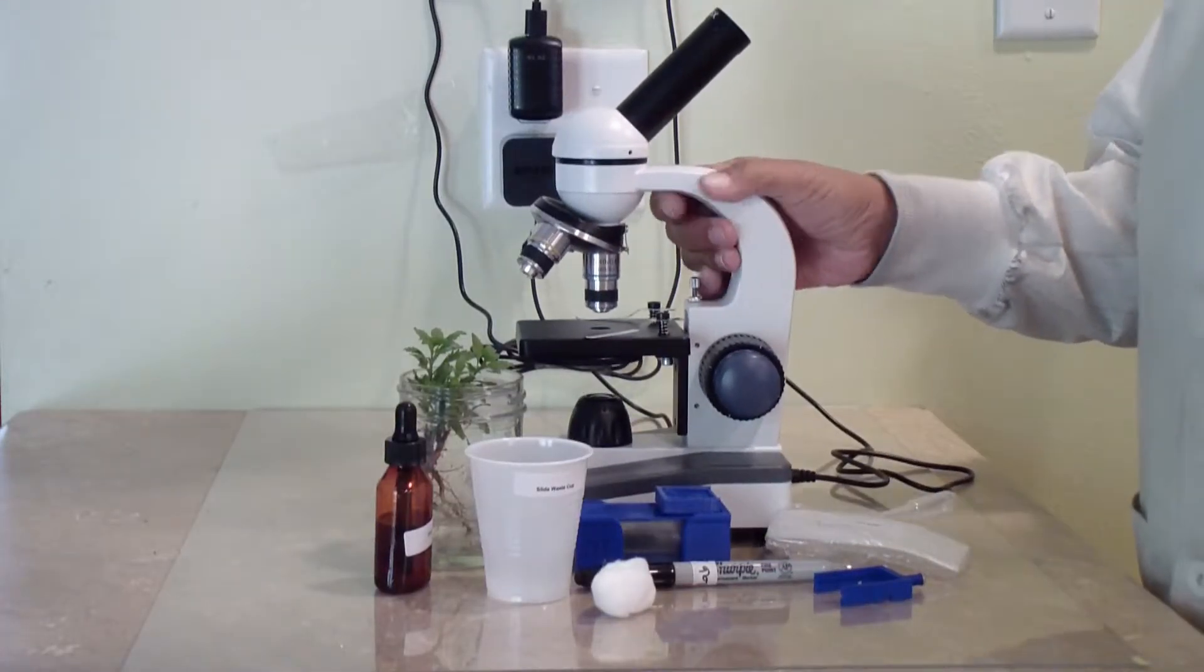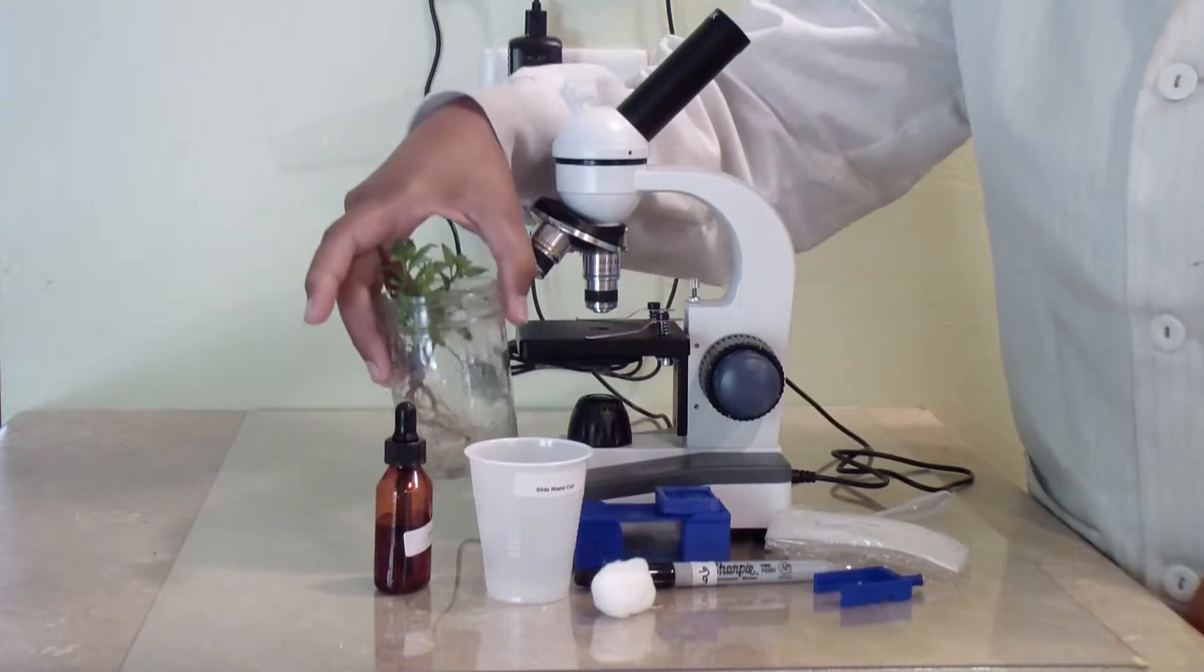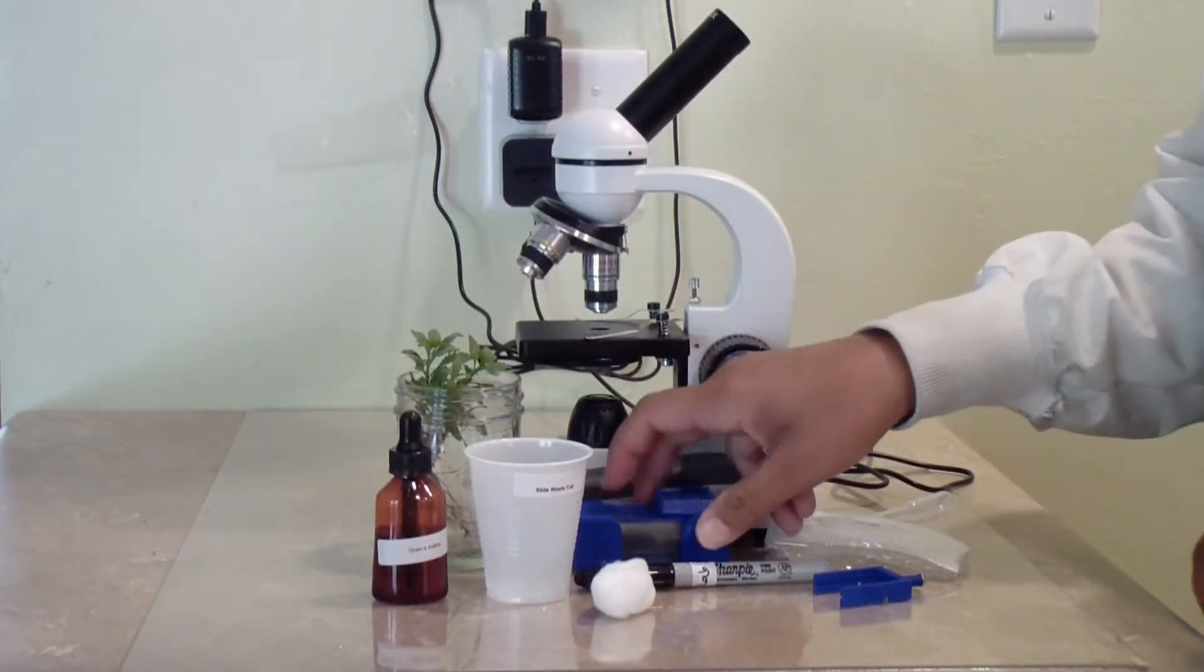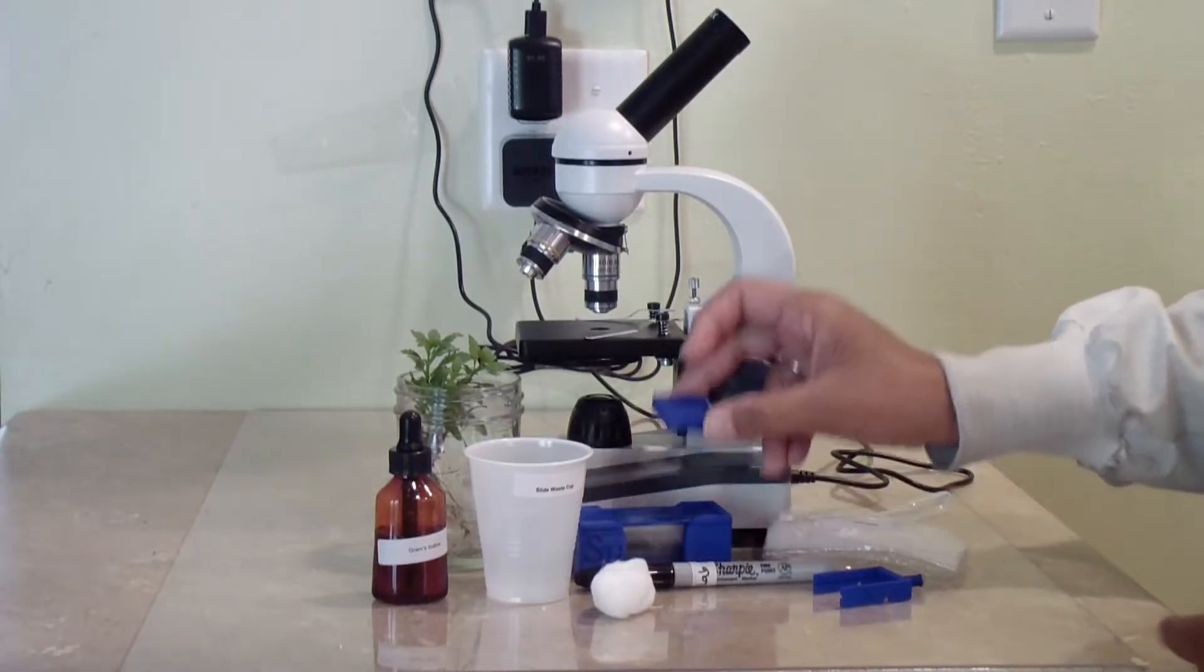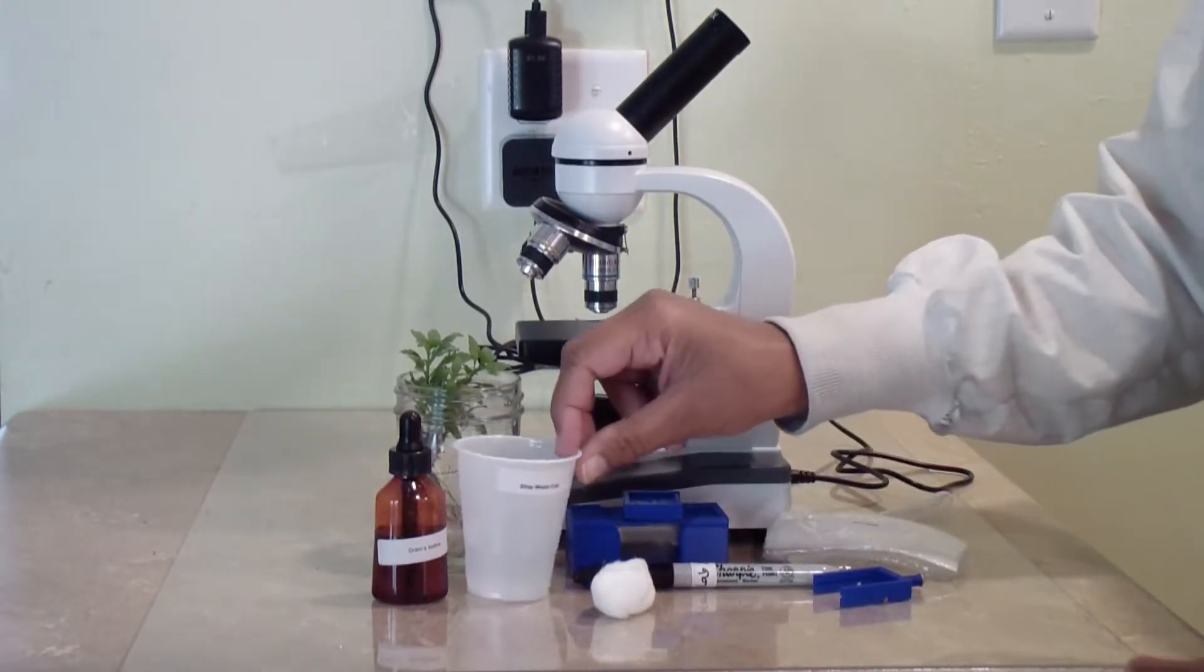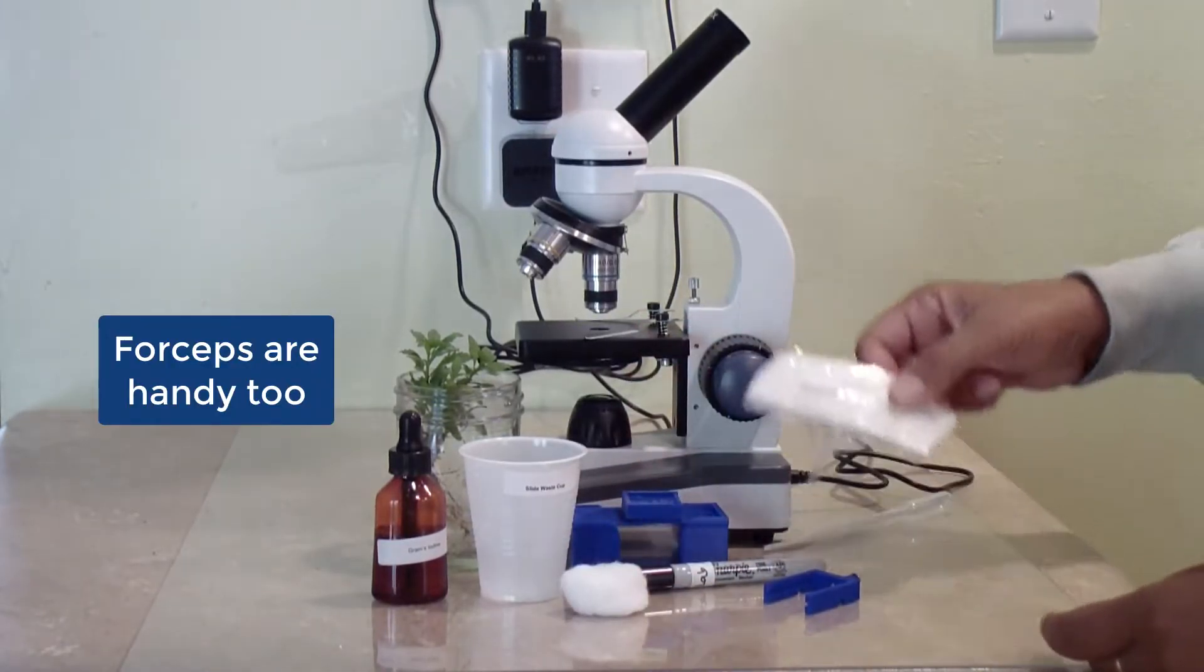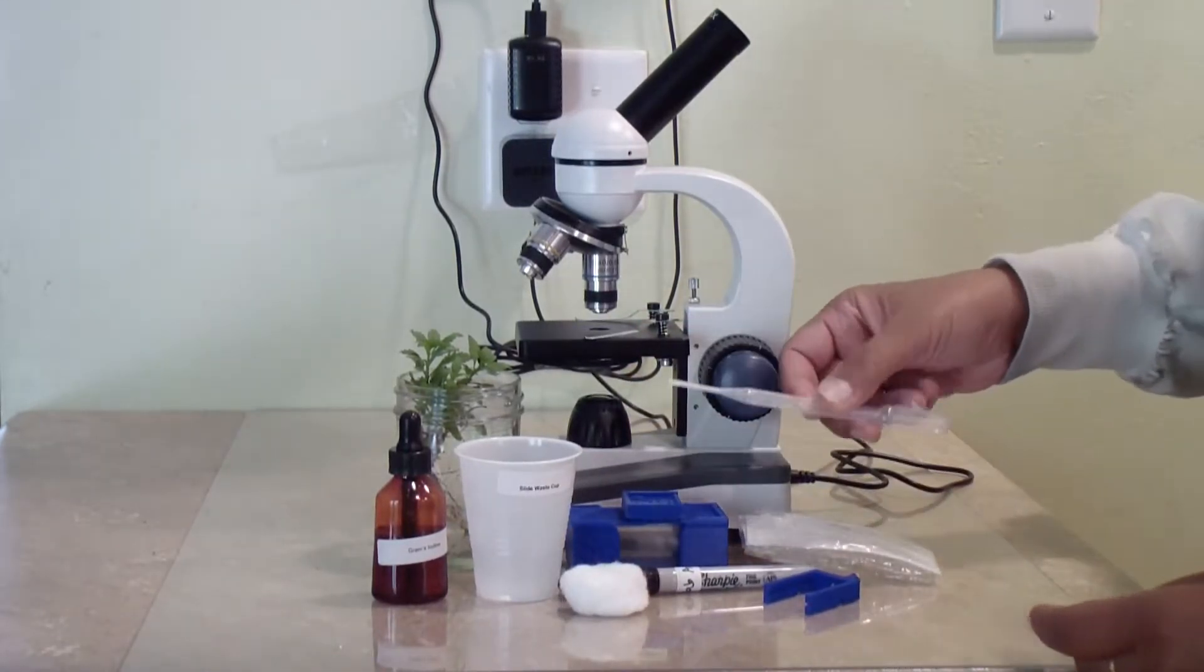The supplies you need are the microscope, the wet mount sample you previously prepared, grams iodine, a glass slide, a cover slip, the waste cup to catch any spills, the slide holder, a marker, a tiny piece of fiber from the cotton ball, and lens paper.